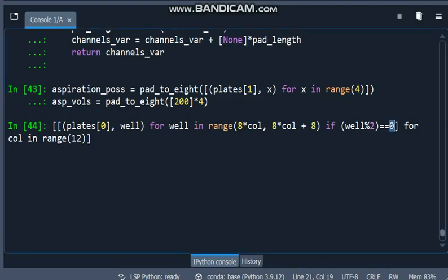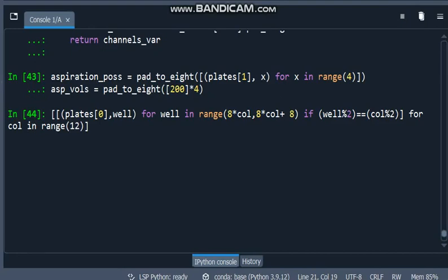from a 0 to an expression that itself will alternate across each column. That'll look like this. This way, the right-hand side of the conditional statement will alternate between 0 and 1 depending on which column we're targeting. This will have the effect of shifting which set of wells we're targeting across columns by 1 well. Finally, if we want to target the inverse set of wells from the original checkerboard instead, all we have to do is change the right-hand expression to look like this.